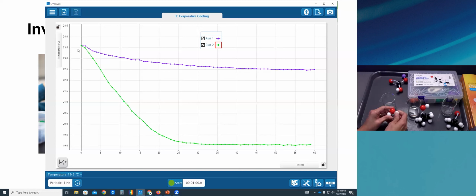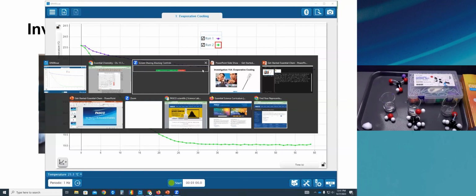And then they can learn about, or if they already know about hydrogen bonding and particle attractions, they can recognize the more opportunities there are for hydrogen bonds, the slower the evaporation rate is. Water was slow. I've got a few areas where we can get hydrogen bonding occurring. Isopropyl alcohol does have an area where hydrogen bonds can form, but not as many opportunities as water. So it evaporates more easily. That's probably related to the hydrogen bonding. What about acetone? There are no oxygen hydrogen bonds on this molecule. I wonder what its profile will look like.